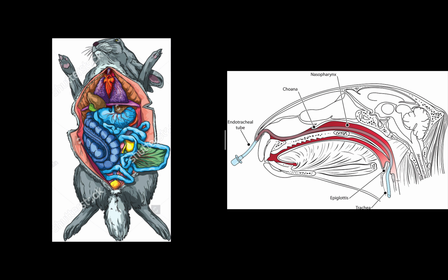you don't choke. The trachea is a strong tube located right here, and sort of a close-up version right here, is a strong tube that contains rings of cartilage that prevent it from collapsing. Within the lungs, right here, if we branch down here, it turns into the right lung and the left lung.